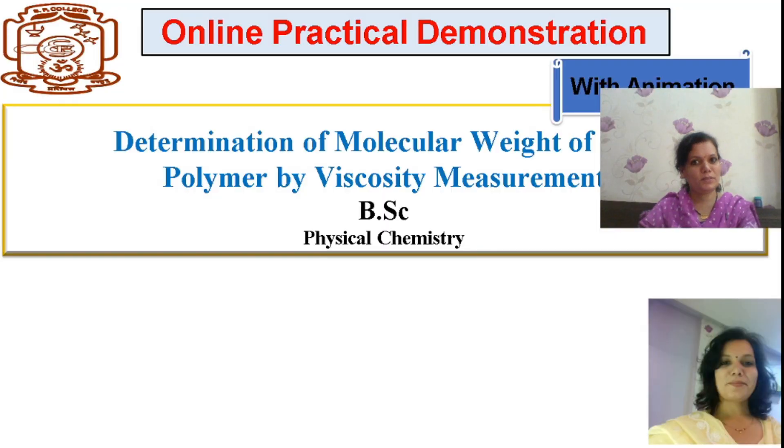Today we are going to see one of the online practical demonstrations with animation to determine the molecular weight of a high polymer by viscosity measurement.